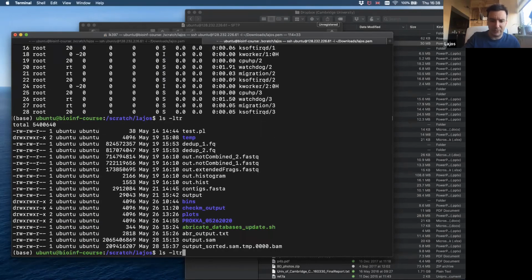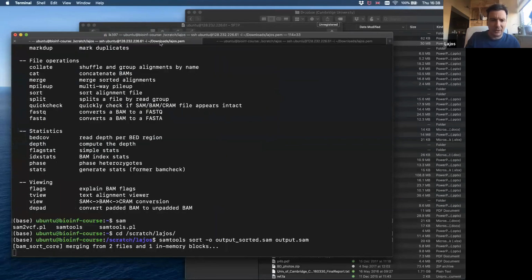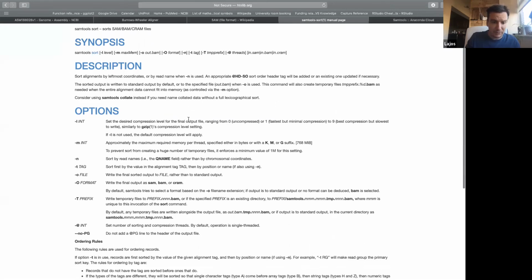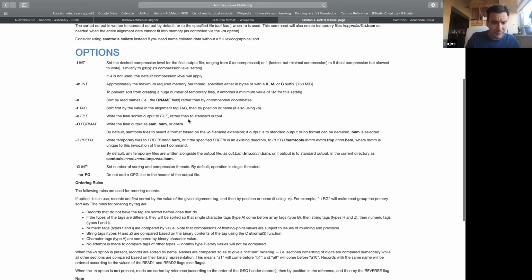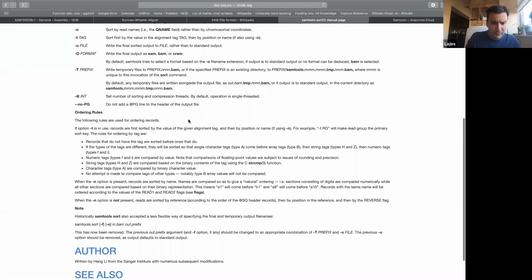No, I think it will extract the SAM. Oh yeah, okay. But it's actually very fast. It's almost half done. The file size should be the same. I don't know if the unaligned ones are in. I can imagine that there is a command to exclude the ones that are not aligned. Maybe not.